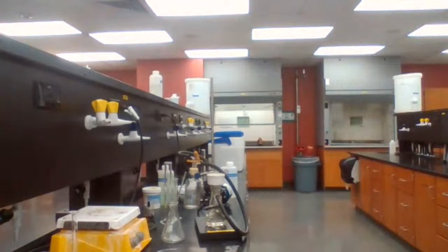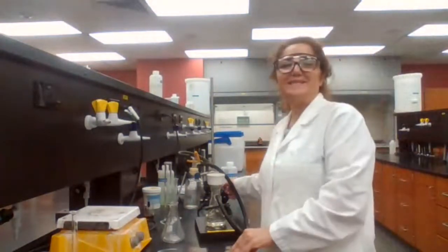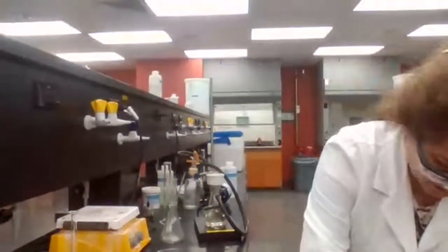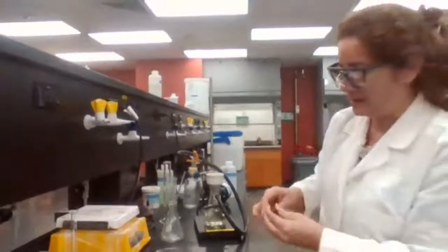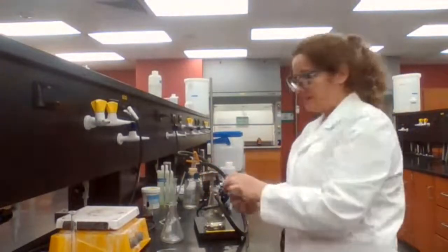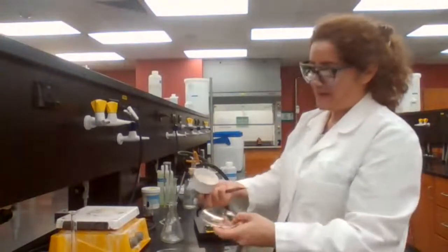Has it been 5 minutes? Yes. Okay. So we take the sample and we place it on a watch glass, the same way that you would bring a cake out of the oven. Sometimes you just flip it and you get the paper with the cake.